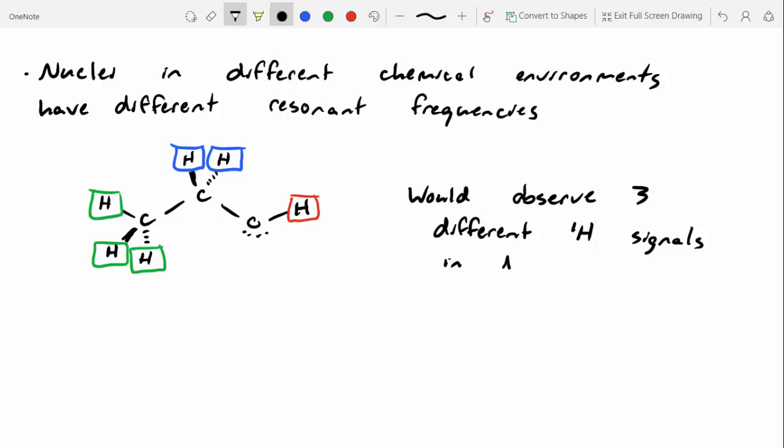in NMR. And you may notice with proton, I always indicate it as 1H, meaning it's the isotope of hydrogen with a mass of 1. Why don't I have 2H? Because it's even, right? We can only observe things that have an odd number of protons and neutrons. Is there a way to understand why that is? That's getting into kind of complicated physics. We're not going to talk about it much in this course. Yeah, we can talk about it later if you want, though.